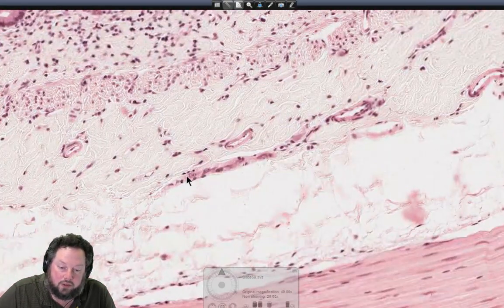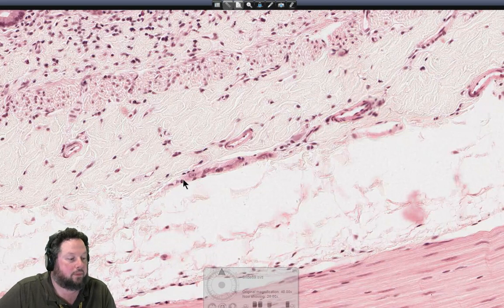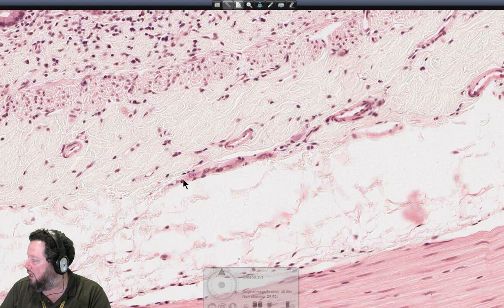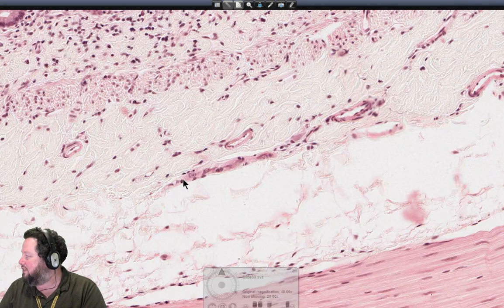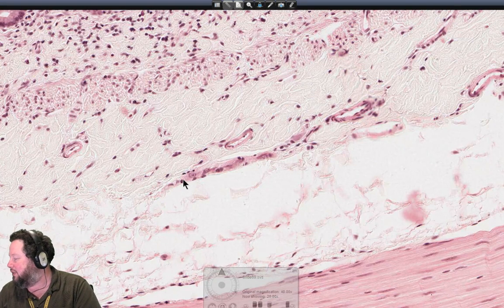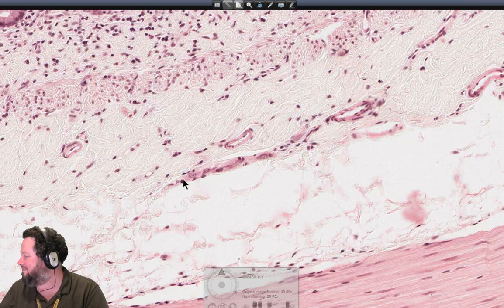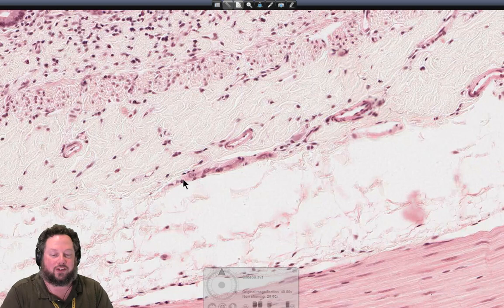This is part of, James is going to be able to help me here because I can never remember myenteric versus Meissner's. Which one's in the submucosa and which one's, Google it, dude. James is going to Google it. You looked it up, right? Sorry? You did it at the prac. Yeah, I know, and we've forgotten it already.